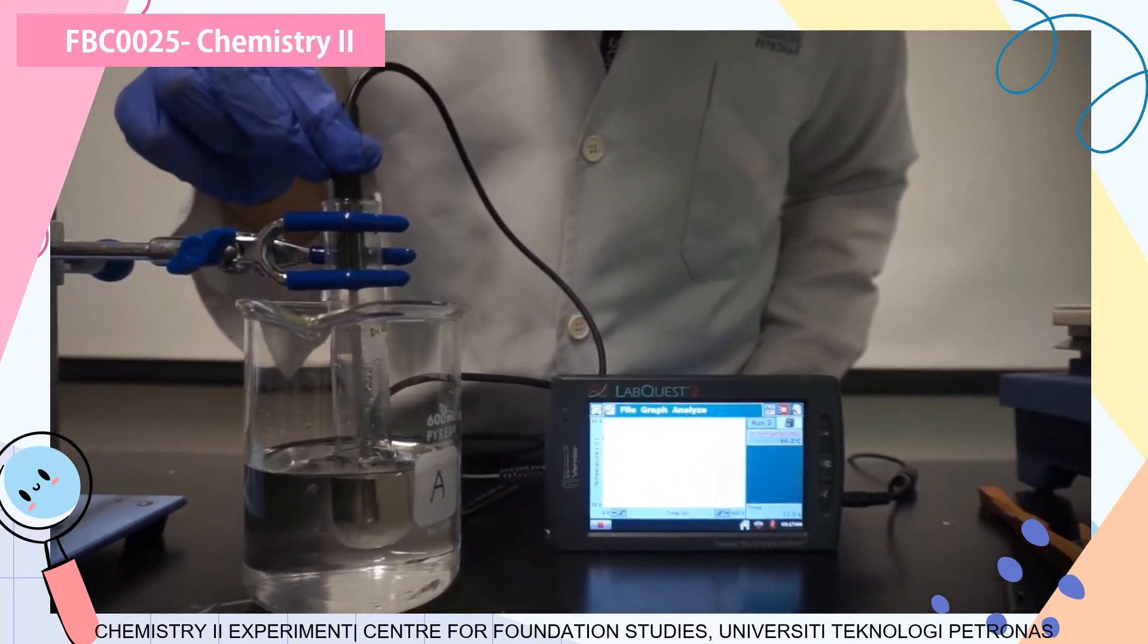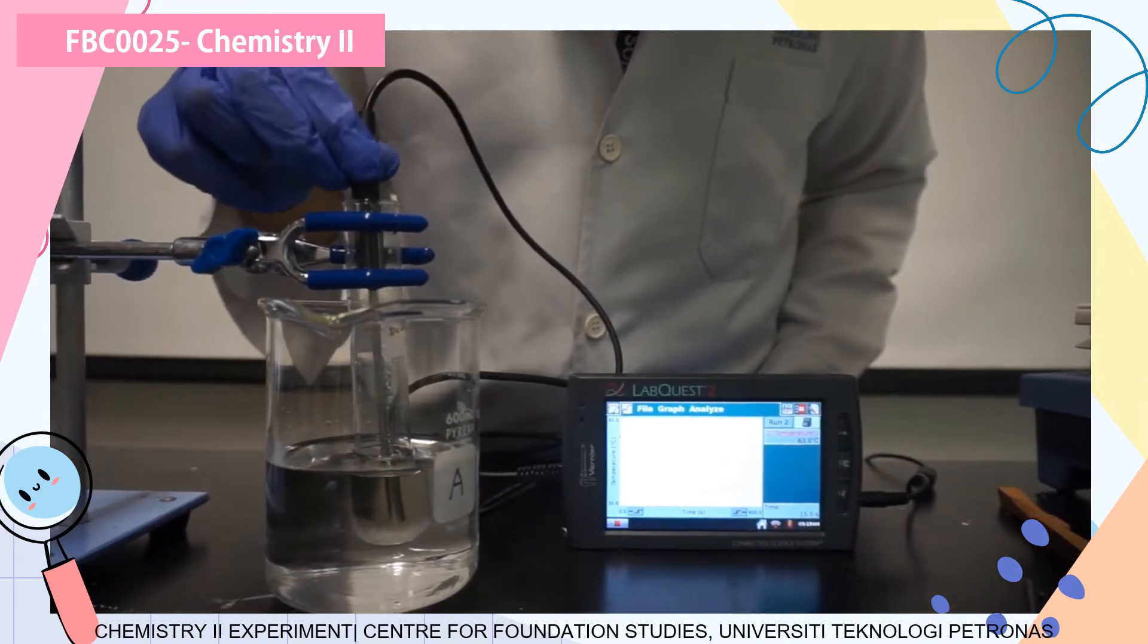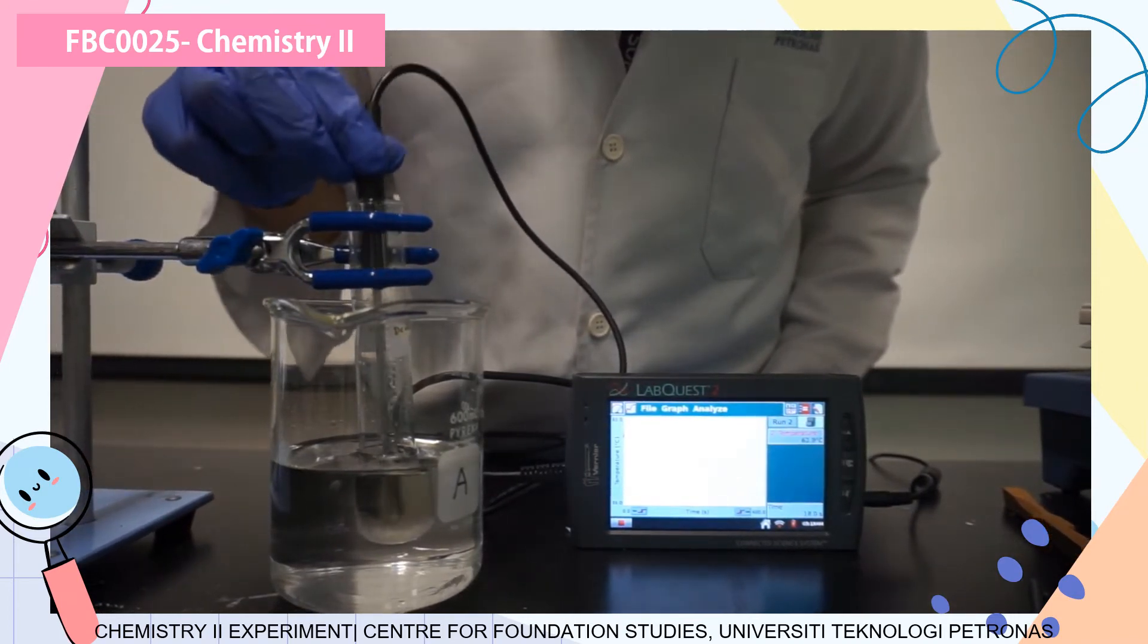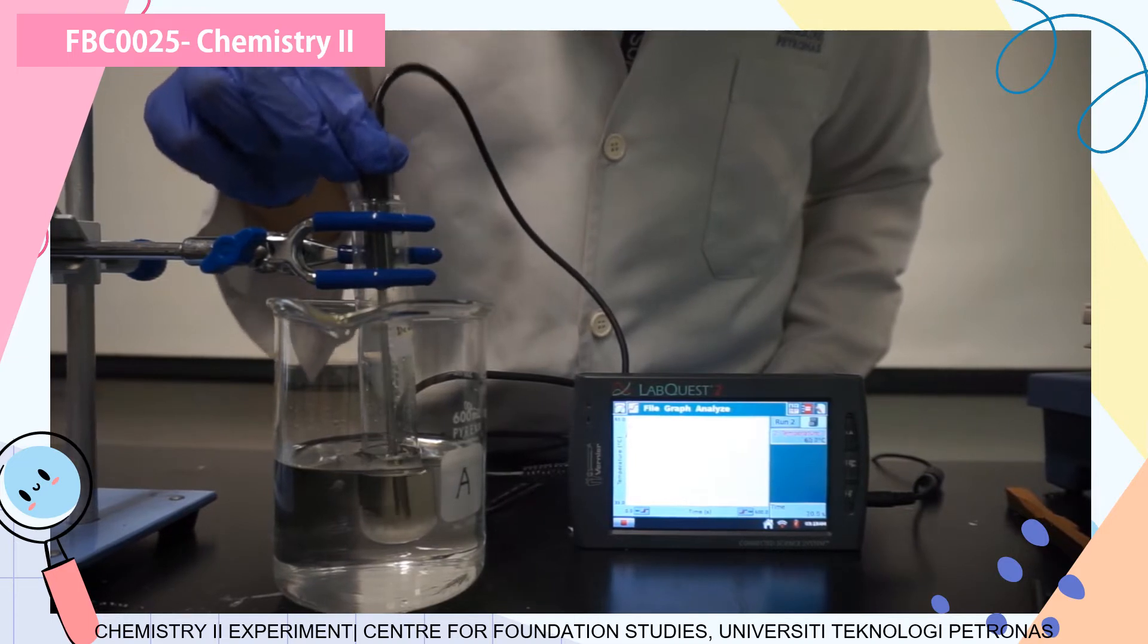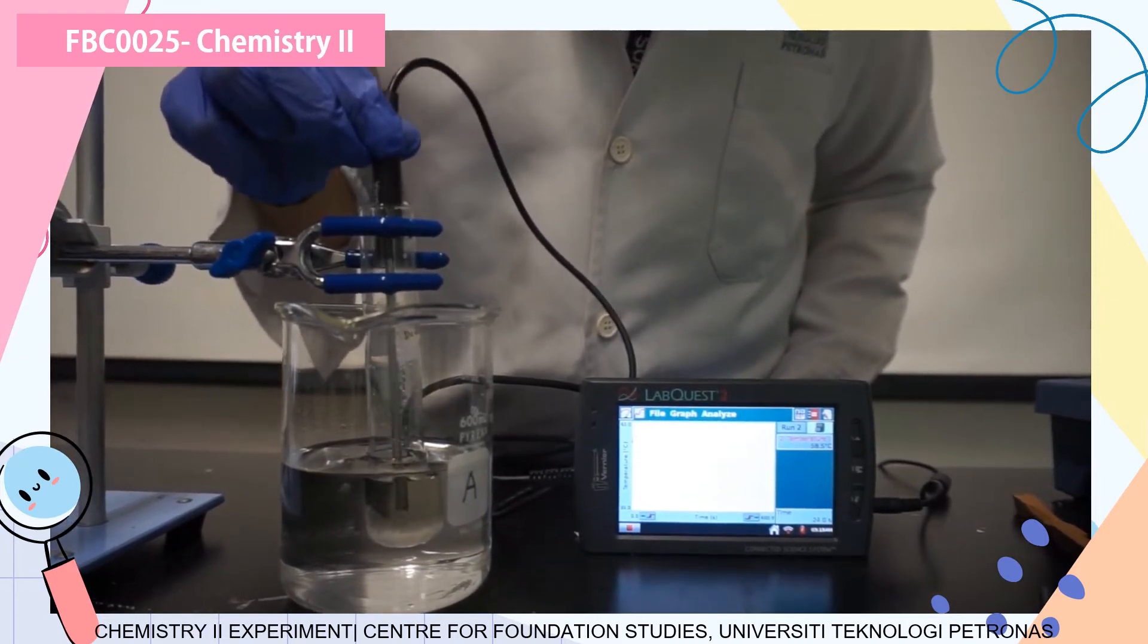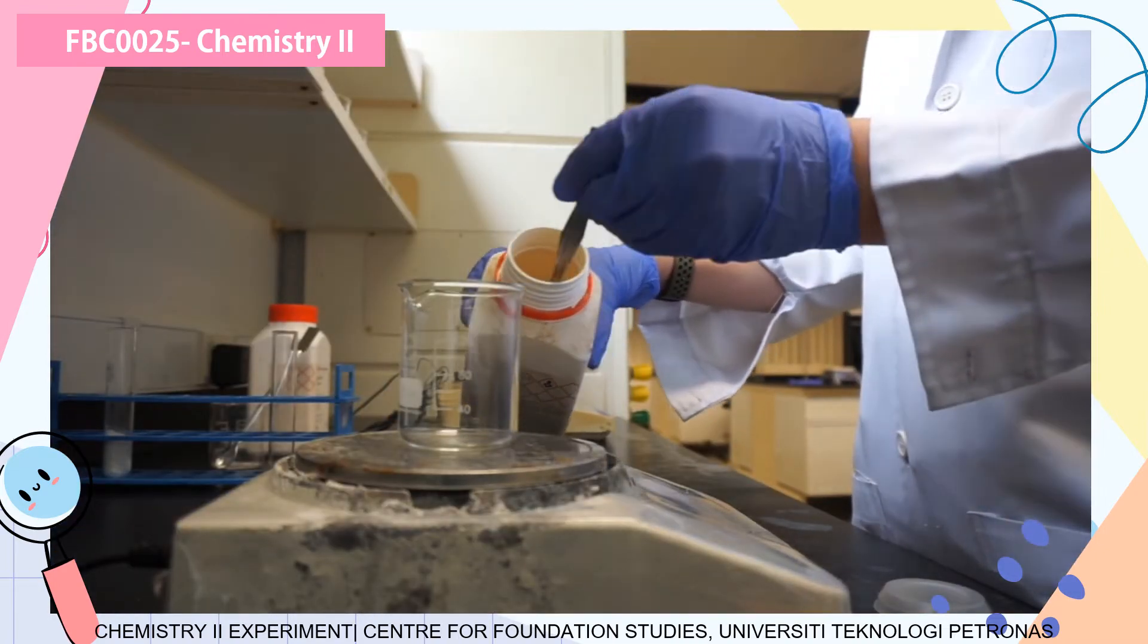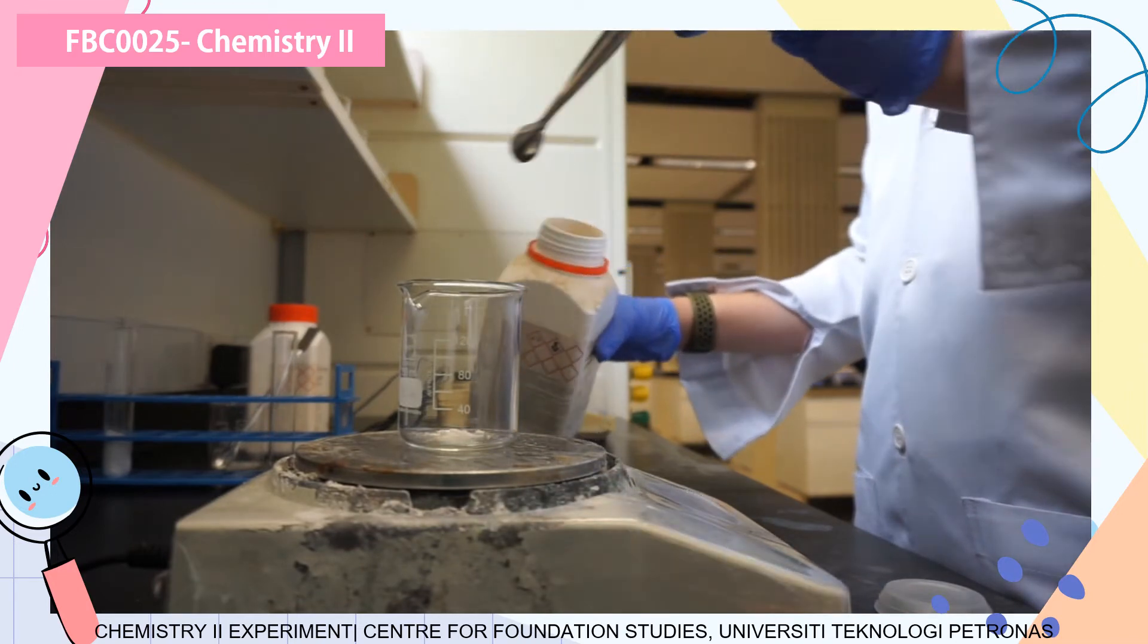When you are doing the data collection, you must stir it gently by pushing the probe up and down. But do not try to stir it like you are making some iced Milo. Be gentle in the experiment. After that, you should get the data for the determination of freezing temperature of the solvent or the lauric acid.